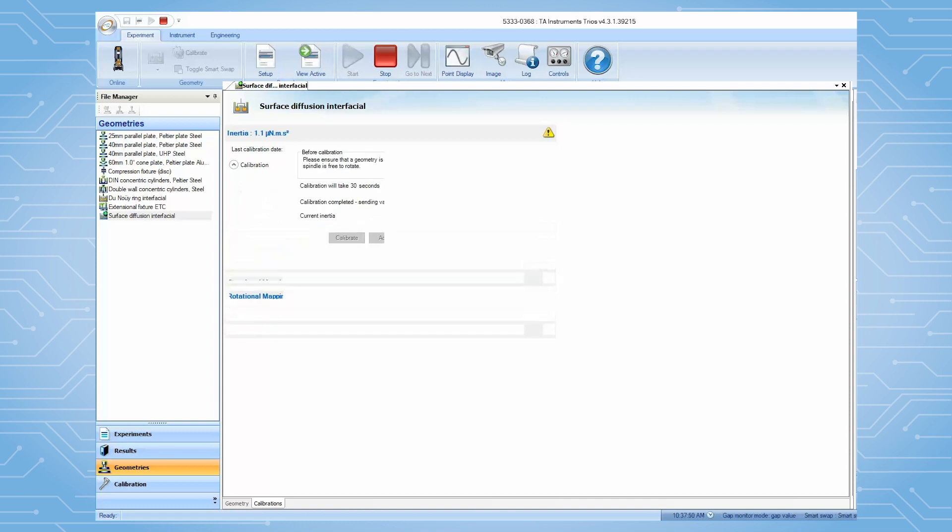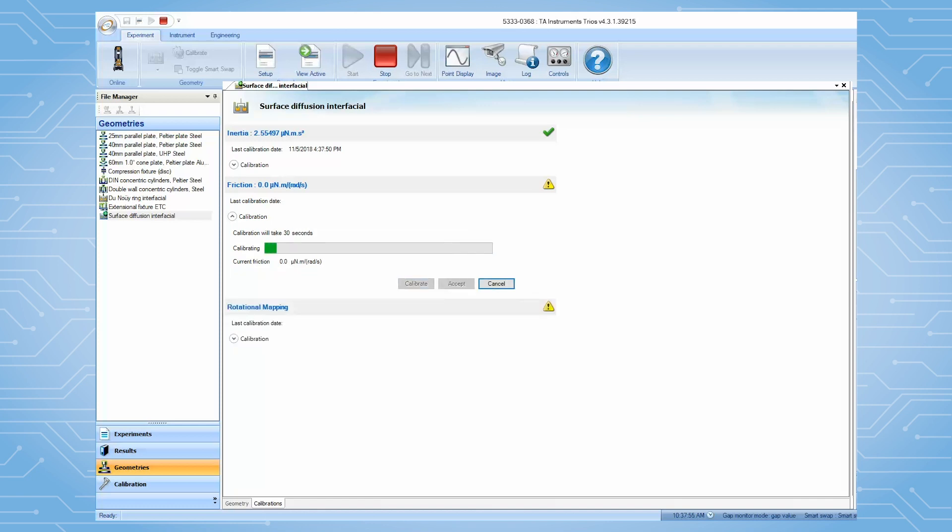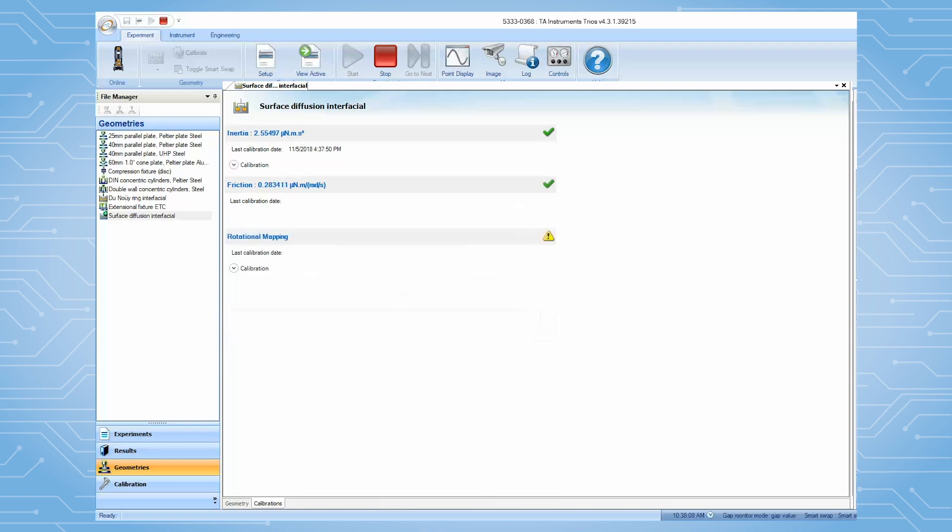Then move on to the friction calibration. The friction calibration also takes about 30 seconds to complete. The residual friction value is usually between 0.2 to 0.3. After it is finished, click on Accept. Then close this calibration page.